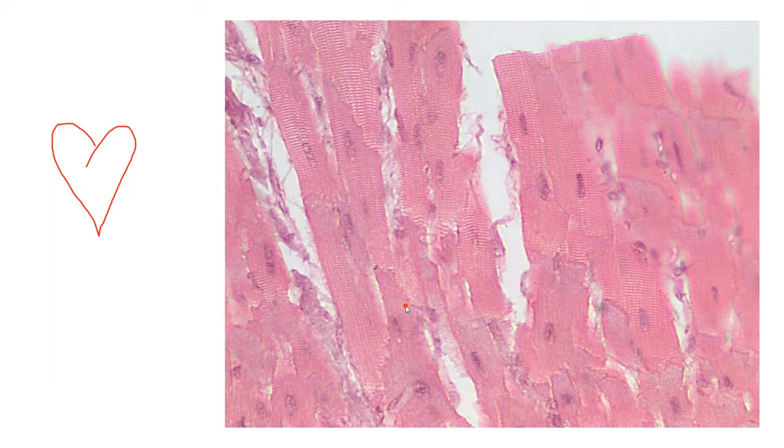The other thing you'll notice on the slides, by the way, is that in between these cells, we actually have some adipose tissue. So on my cardiac muscle slides, if you're seeing striated muscle cells, in between those cells you will also see some adipocytes or fat cells. That's a good way to distinguish it from a skeletal muscle cell, where there's not going to be stuff in between.